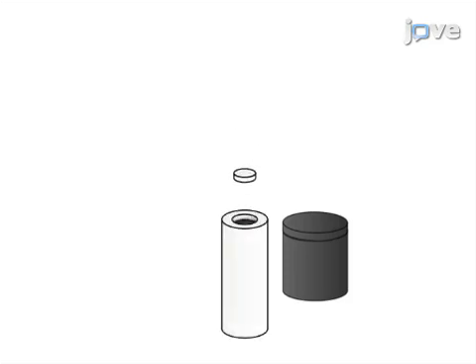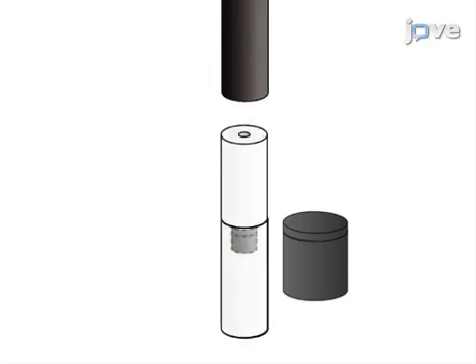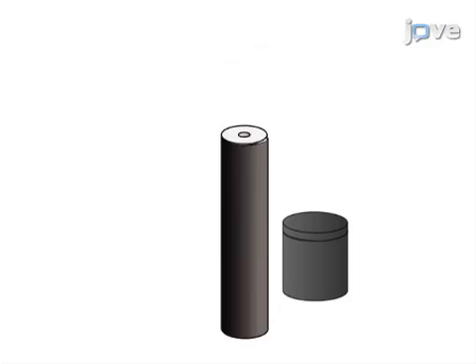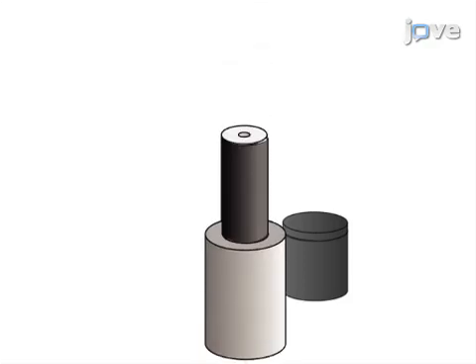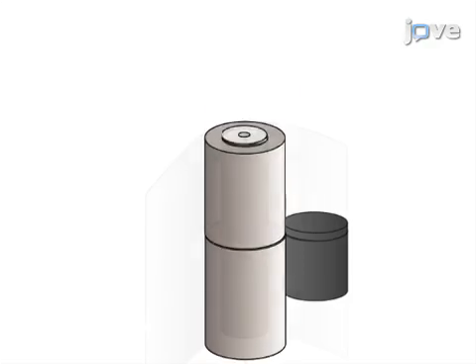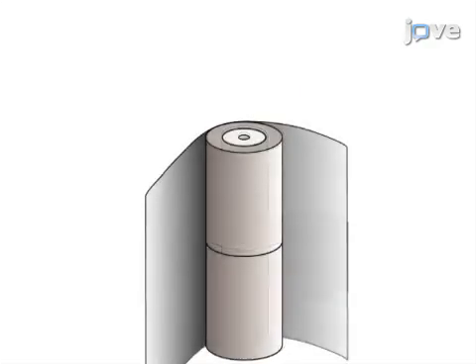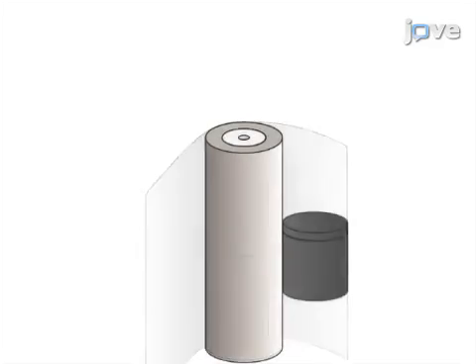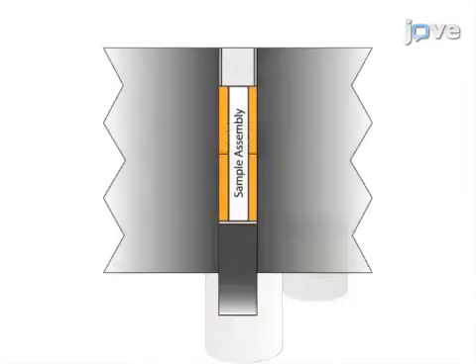Next, complete assembly of the sample components and load into either a piston cylinder or multi-anvil apparatus as appropriate.